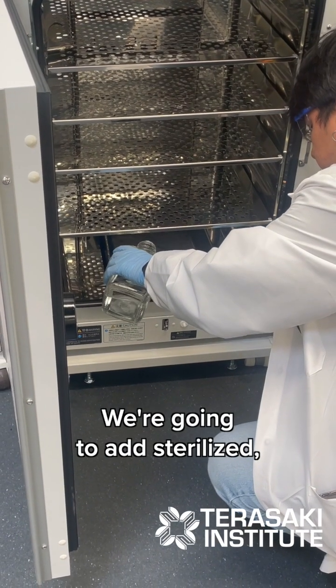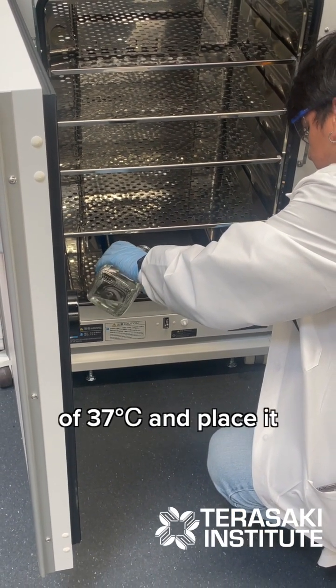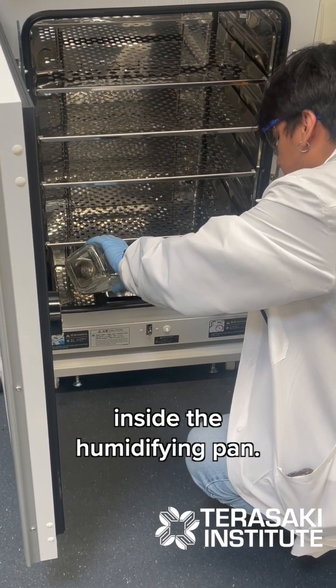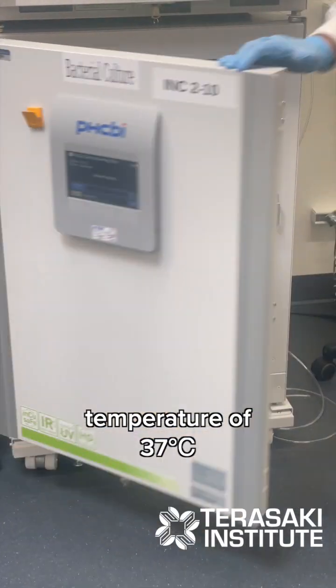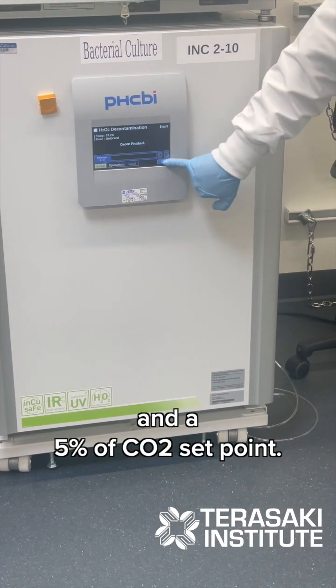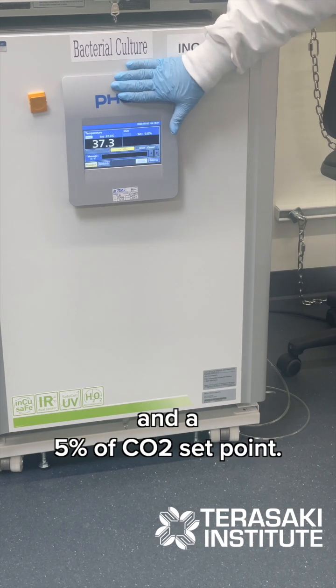We're going to add sterilized distilled water at a temperature of 37 degrees Celsius and place it inside the humidifying pan. We're going to let the incubator reach its proper temperature of 37 degrees Celsius and a 5% carbon dioxide set point.